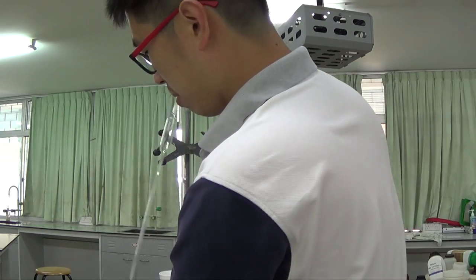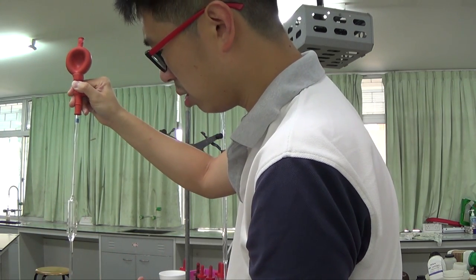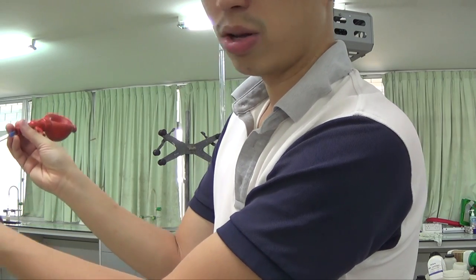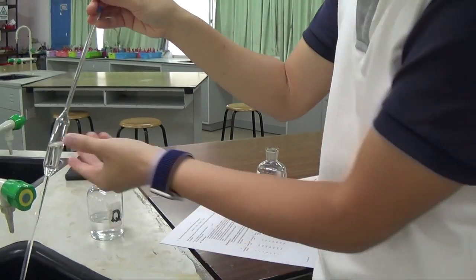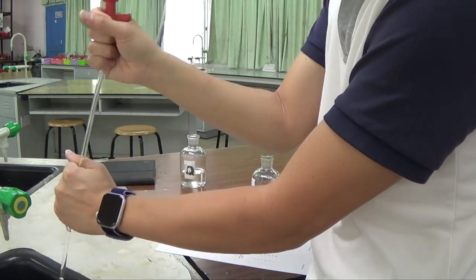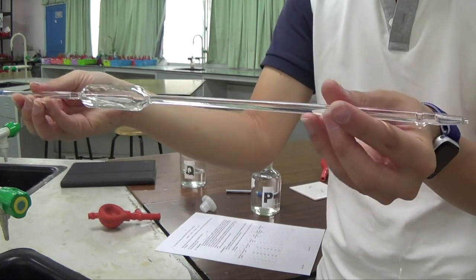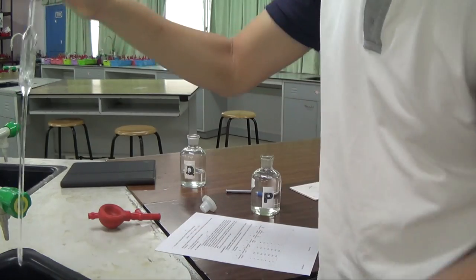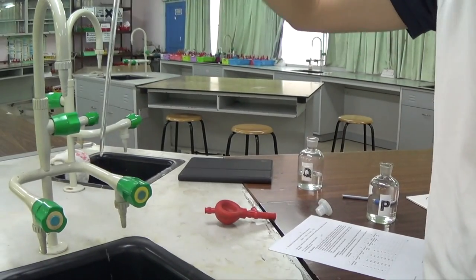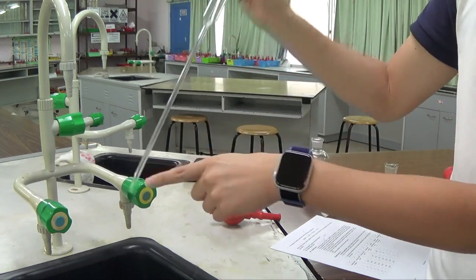I want to add 25.0 cm³. Remember, my pipette was used for something else previously, so I'll suck it in first. This is actually not my clean solution, as in I'm not going to use this for my reaction. I'm not filling up my pipette, I just want to rinse it. So I take it out by rotating my pipette filler, and now I have solution in here. I swirl it so that it rotates around. I rinse it like this, washing the inside, the bulk of the pipette. Don't worry about the last bit of the liquid.